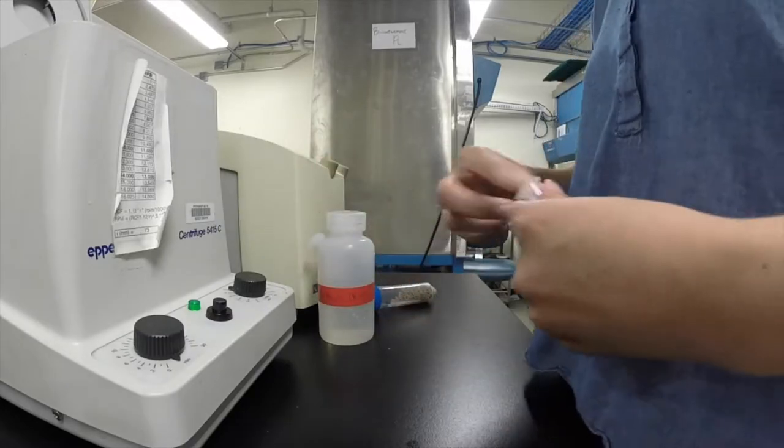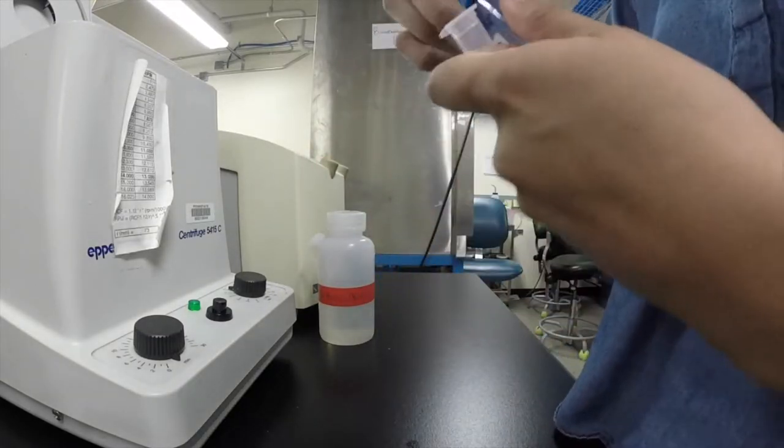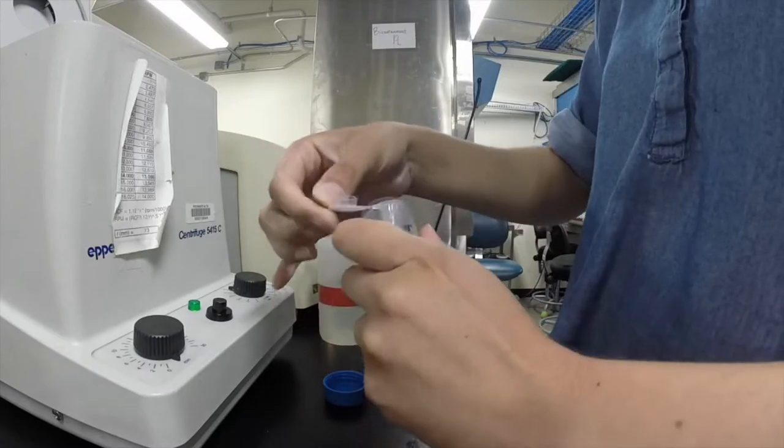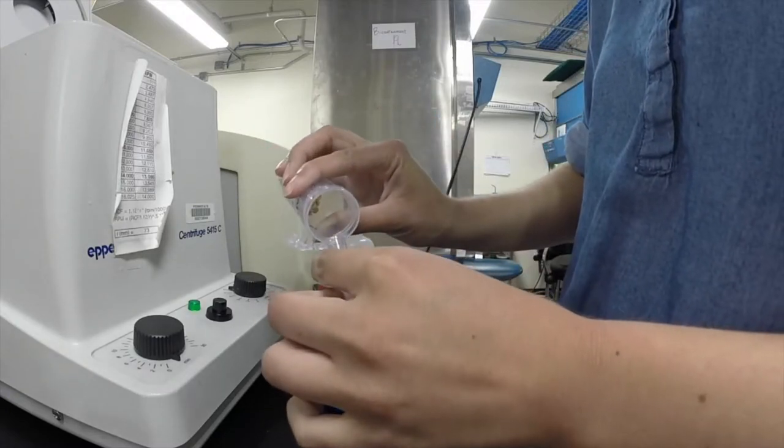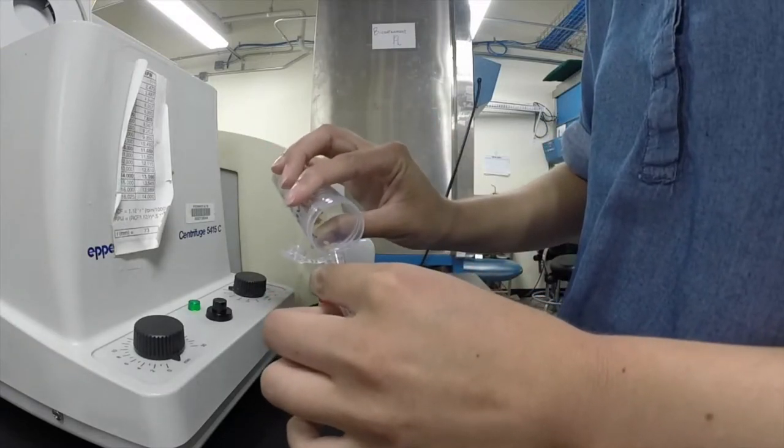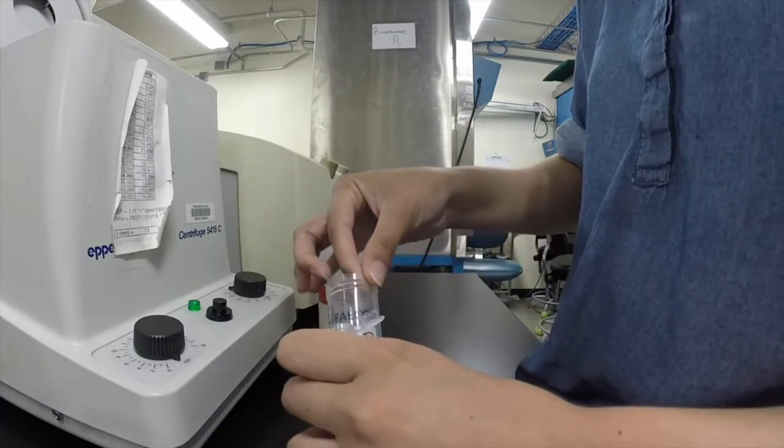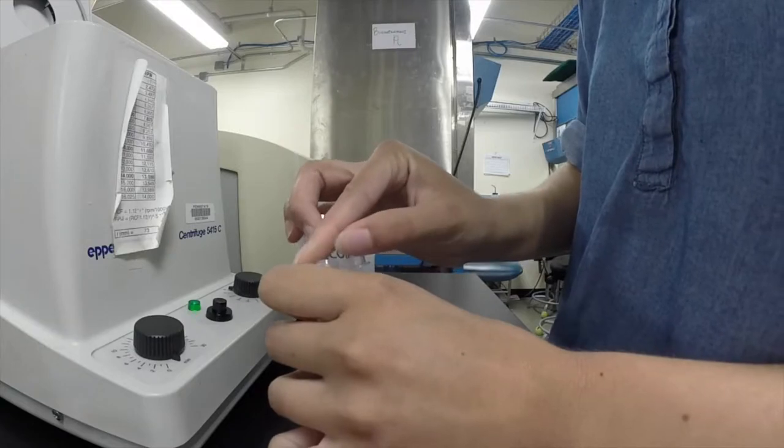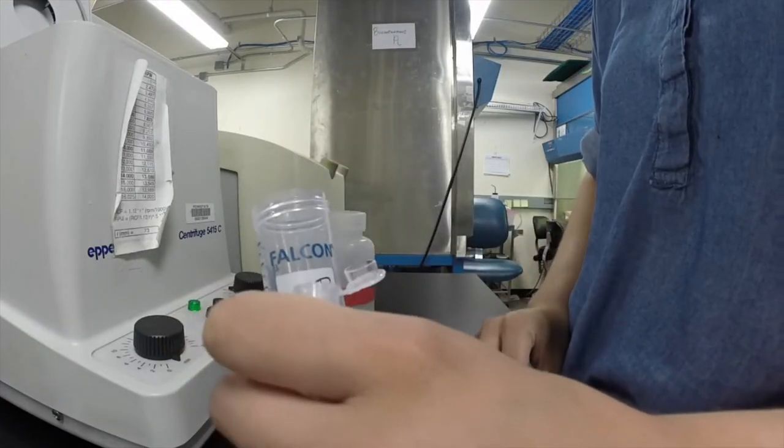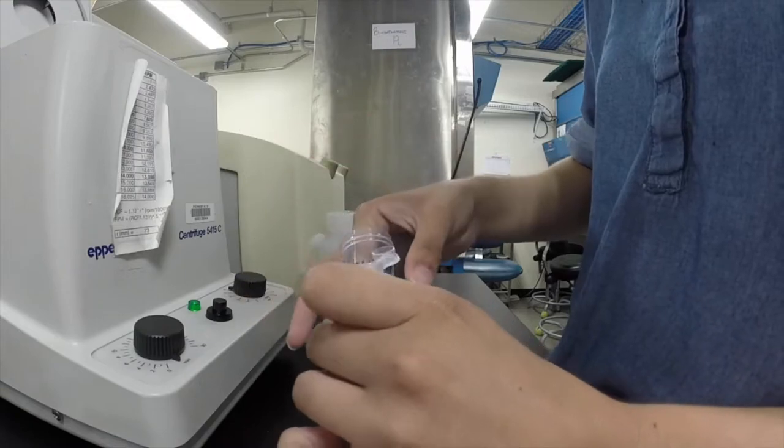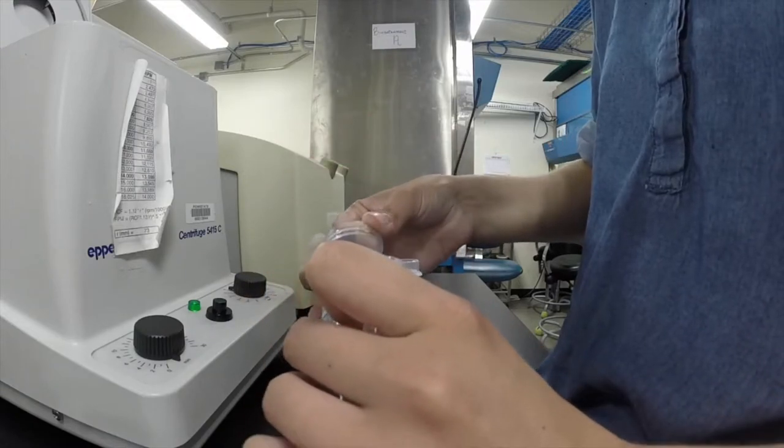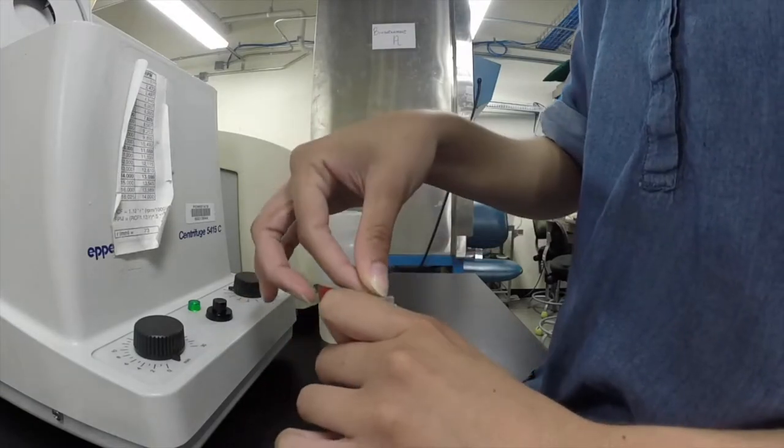What we're going to do is take some of the seeds into the epi tube. We're going to fill the epi tube about halfway. We want to make sure there's plenty of room for them to slosh around and get sterilized.